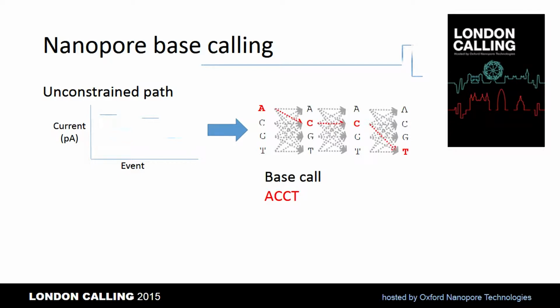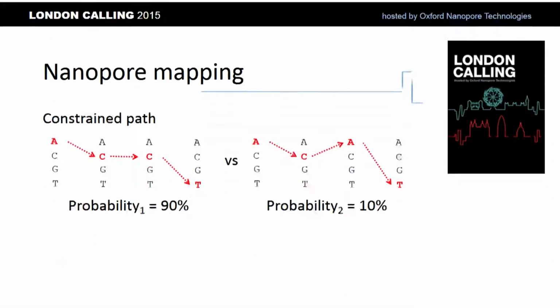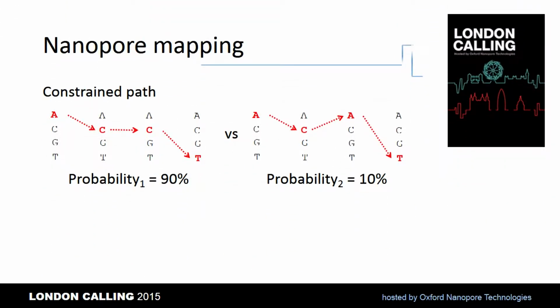This is accomplished using a hidden Markov model of all possible transition paths. The base call is the maximum likelihood path. Alternatively, we can constrain the transition path and evaluate which of multiple fixed paths are the most likely given the data. For more information about constructing your own models, please see the applications Pecha Kucha entitled Custom HMMs, designed for your biological context.